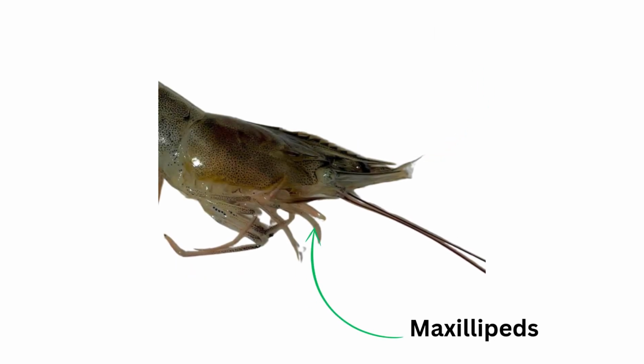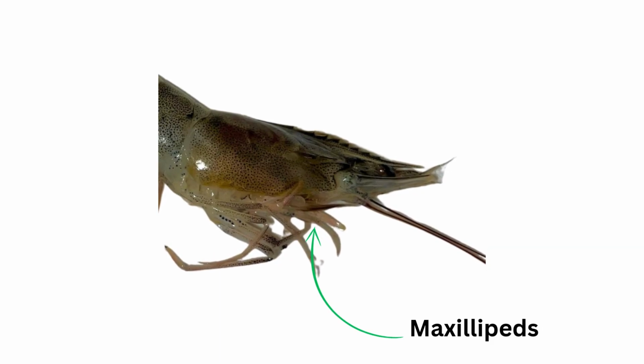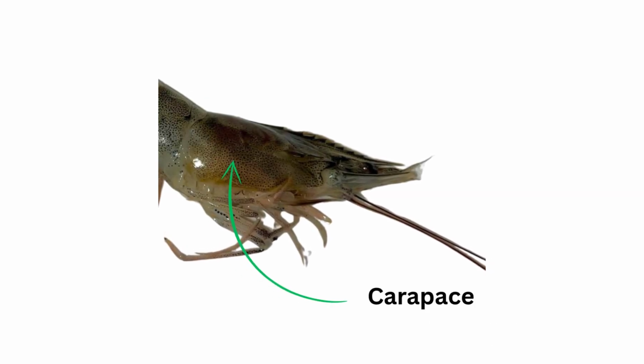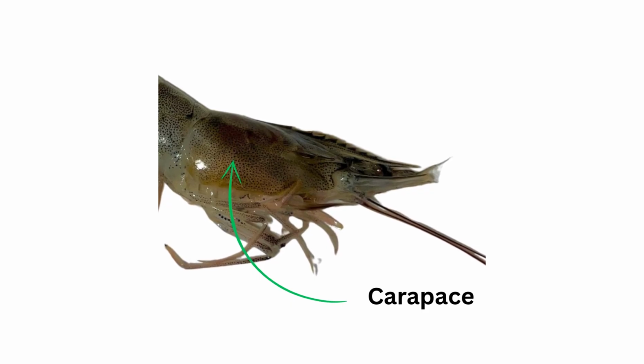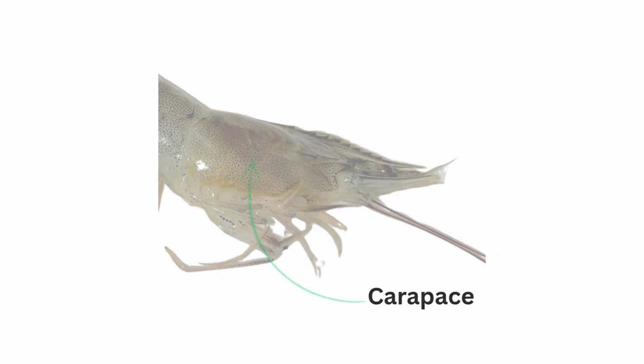Maxillipeds. Maxillipeds are paired feeding appendages found near the mouth. Shrimp typically have 3 pairs, and they help in holding, tasting, and manipulating food before it enters the mouth. Carapace. The carapace is a hard protective shell that covers the cephalothorax. It shields the shrimp's internal organs and gills from damage and predators.